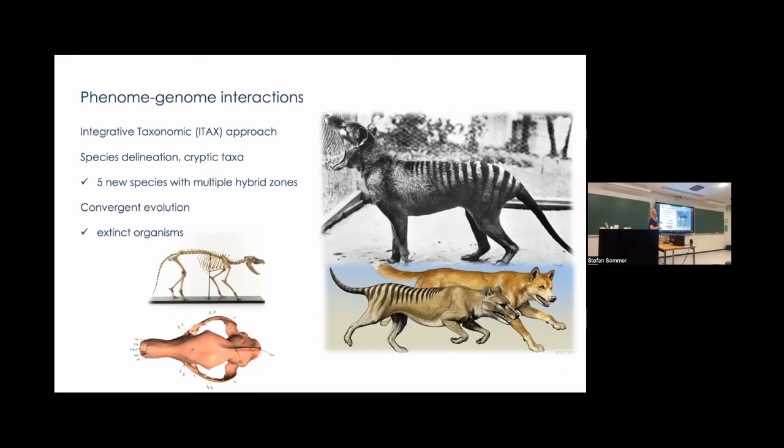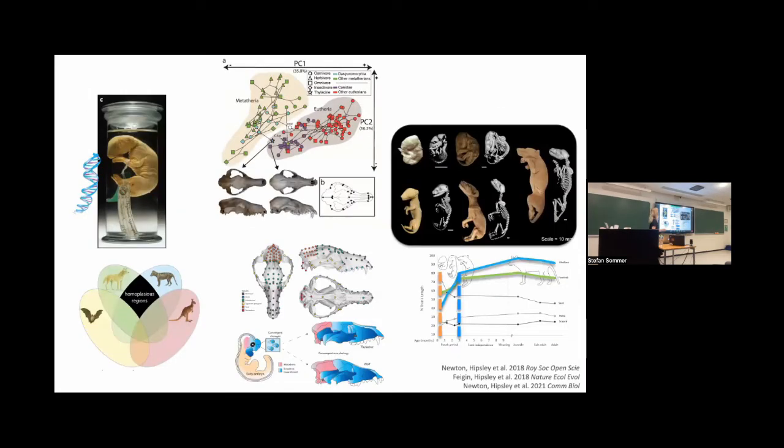So we could scan, I don't know how many we got in the end, several of a dozen or so of the thylacines, lots of other mammals. We also got data from Anjali that had collected the same landmarks over fossil mammals. And we could do lots of different things. This is just a smattering of work from different papers over the years. But we first started out just saying, yeah, they look similar. We just eye that up and say, yes, they're convergent, but can we quantify it and how? And putting morphology into a geometric context lets us do that.